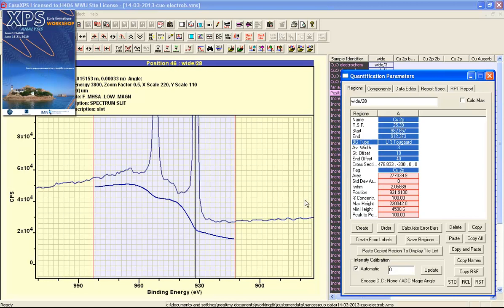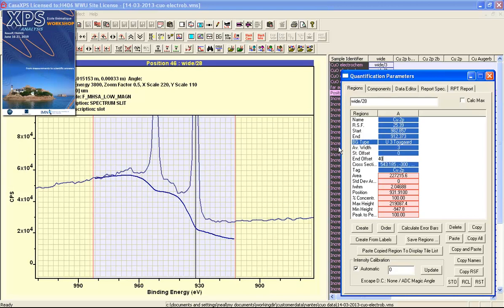Similarly, I could do this 20% or let's say 40%. These are intended to allow for shapes that might appear in the data at the region limits that would compromise the calculation of the background. In this case, we don't need offsets to the background at the start and the end.